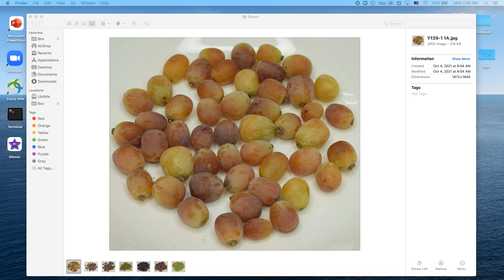Once we segment our image and pull out the berries from the background, the next step is to convert the RGB image — taken with a basic digital camera — into other color spaces like the LAB color space and the HSB color space. The idea is that while RGB is a simple way to present color on a computer monitor, we may do better to define variation in grape color using different color spaces. We'll then separate each color space — RGB, LAB, and HSB — into the three component channels that make up each one, and get summary statistics for each.